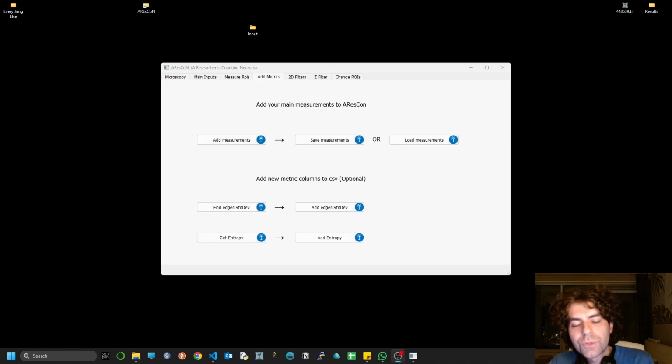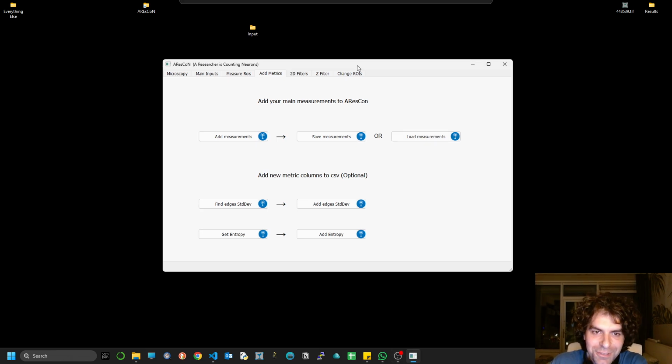We're back from where we stopped, and now, as you can see, there's no blocking icon or something, so we have a clear screen to continue with our tutorial.